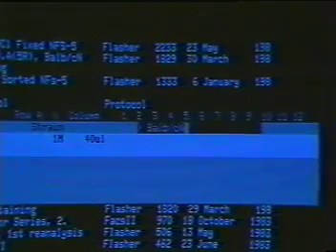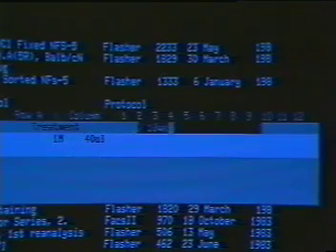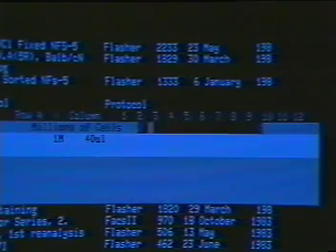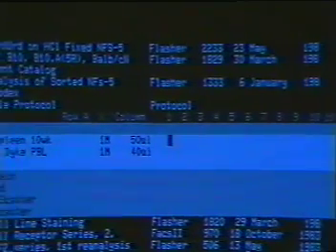In this example, we'll answer the prompts for mouse spleen cells. We type in the strain, BALB CN, then press return. The tissue, spleen. For treatment, the age of the mice, we select 1 million cells per sample in a 50 microliter dilution. When we press return after the final prompt, the secretary adds the new line below the first pipetting line we inserted.